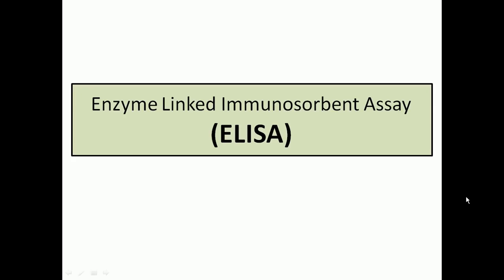Welcome back guys. In this video tutorial we'll be talking about the enzyme linked immunosorbent assay, or simply known as ELISA. ELISA is a very sensitive technique to detect the presence of antigen or antibody in blood, right? So that's why we use ELISA.